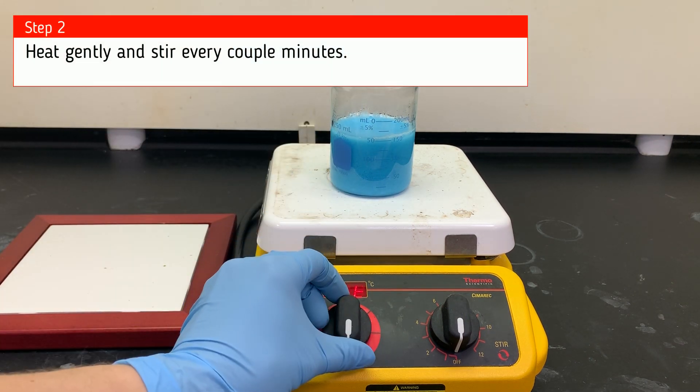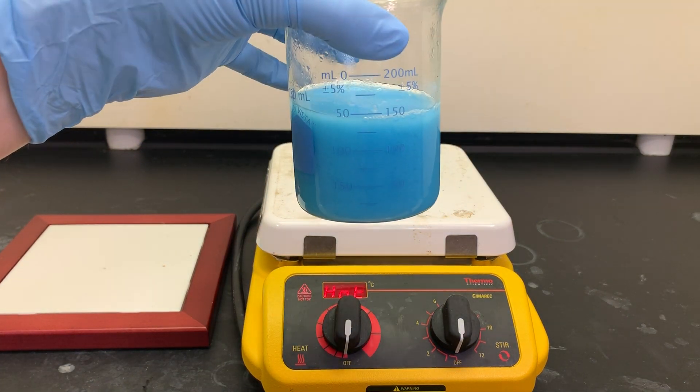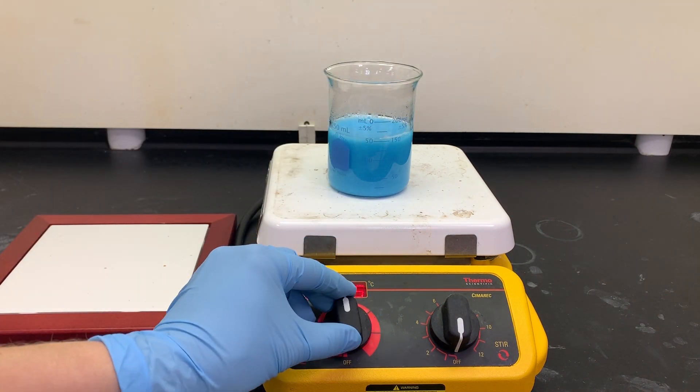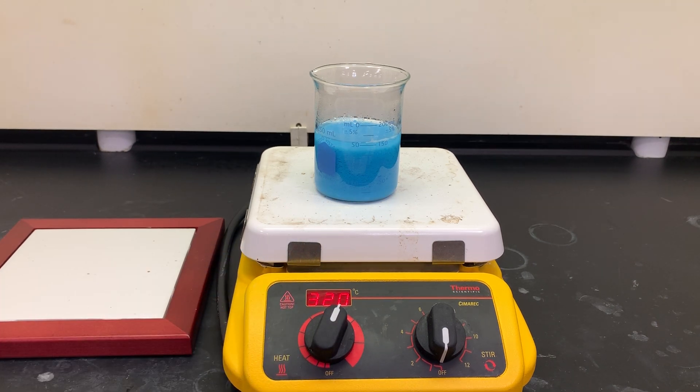Now we're going to heat gently, stirring every couple minutes. Before this reacts, be sure you write your observations of the reactants. This heating step takes a while so I'm going to speed up the video.